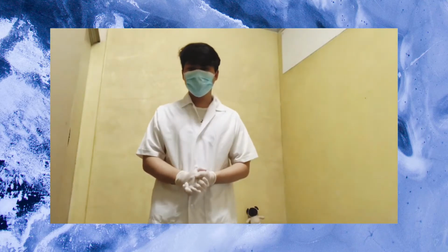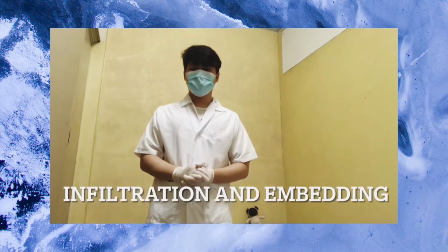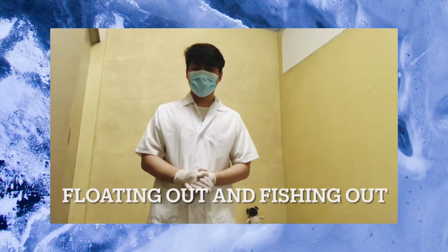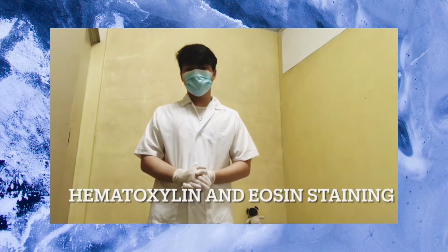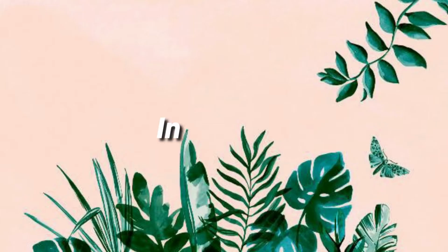So, moving on, the procedures that we will be demonstrating in this video are the following: infiltration, embedding, floating out and fishing out of tissue sections, hematoxylin and eosin staining, and mounting. And these will be done by my groupmates.